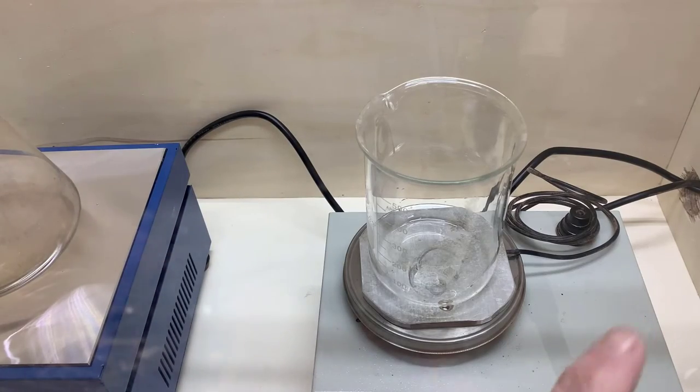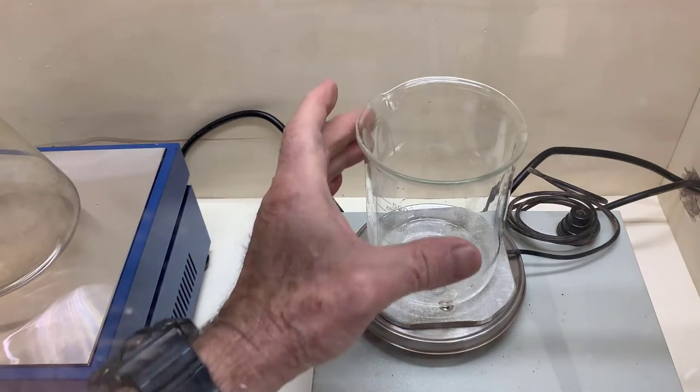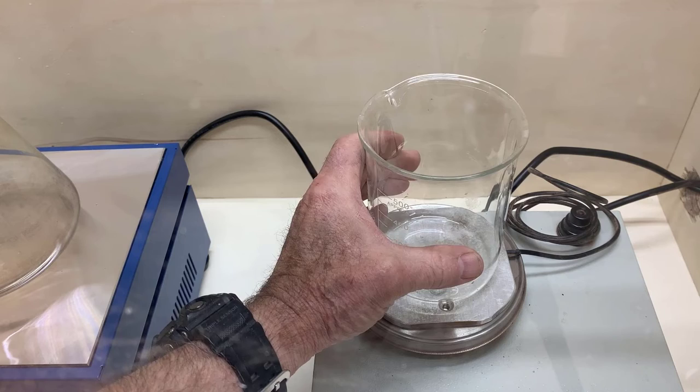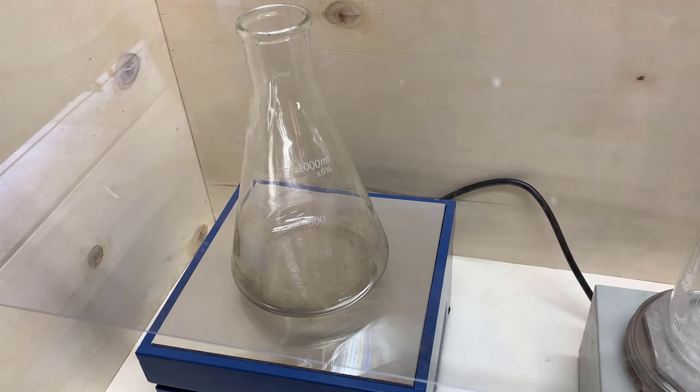I'm filming through the polycarbonate — you can probably see the reflection — but it shows that it's very easy to film with this kind of configuration. So I'm totally happy with it. It took about two and a half hours to build. I don't remember what I paid for the fan, but the little four-inch fans plus the ducting come in a little kit. Very inexpensive.